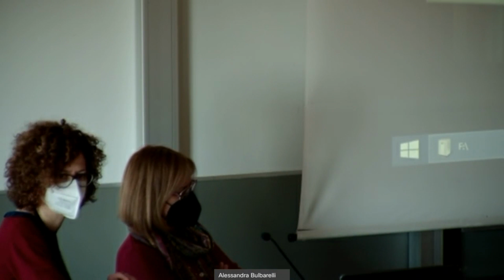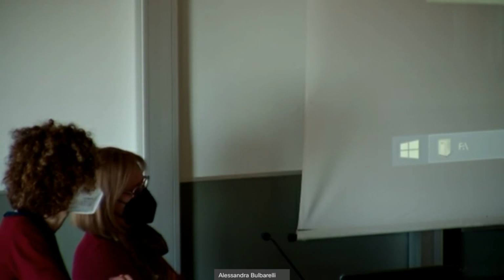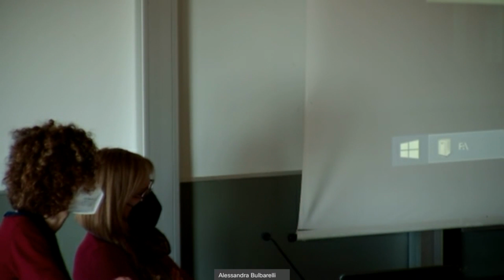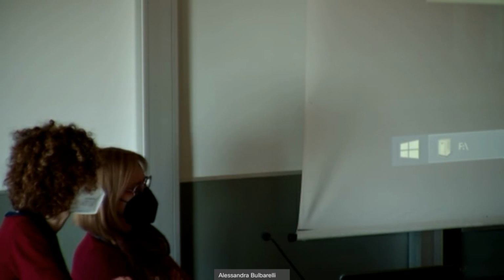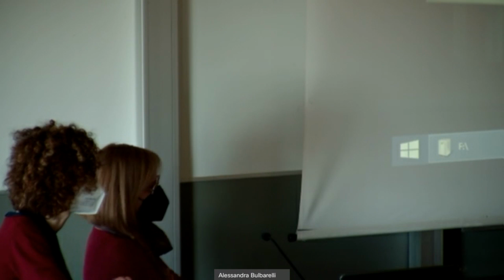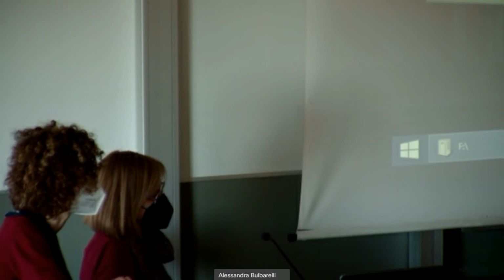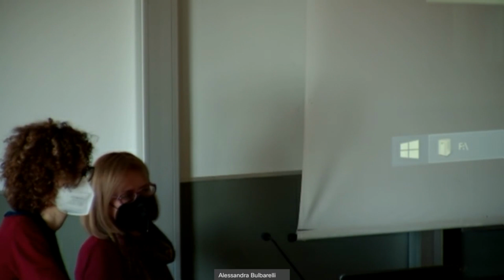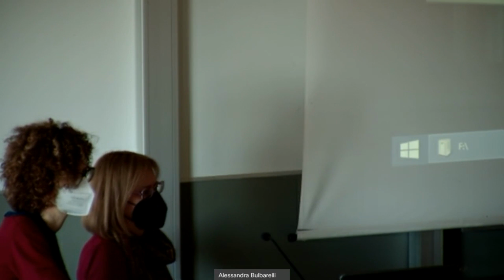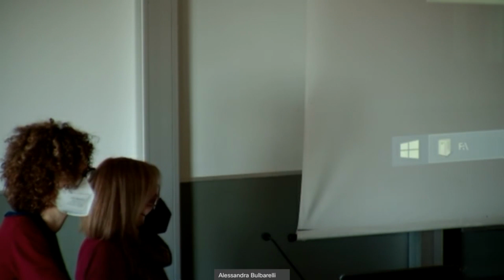Because if we try to do it in a resolution to have the cellular details, then we can image only very small areas. So that's another point. We were trying to image as large an area as possible that we can do with the microscope and still be able to identify the fibers and the cells, to cover mostly the most part of the biopsies.